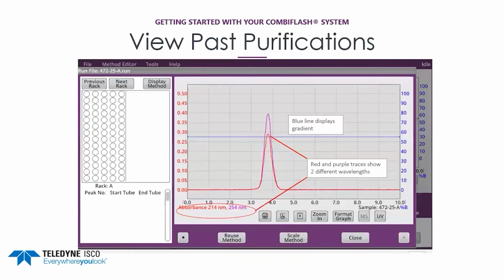You can see completed runs using File Open from the main screen and selecting the file name. The gradient can be seen as a blue line. This example was an isocratic run where the solvent composition did not change during the run. The 2 UV detector traces are displayed. The purple is the secondary signal.